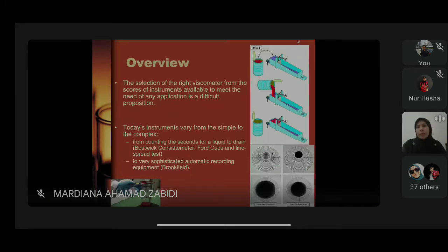Okay, for example this one. Can you see the picture on the right? Okay, this one is used when you are going to measure products that are required to be able to spread. For example, we have jams or probably some chili sauce. And then thick materials, for example canned tomato sauce, or the pasta tomato sauce. So those are going to use this one.